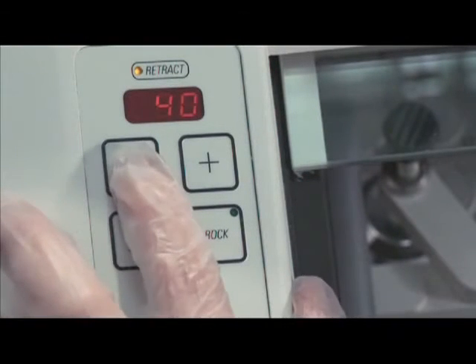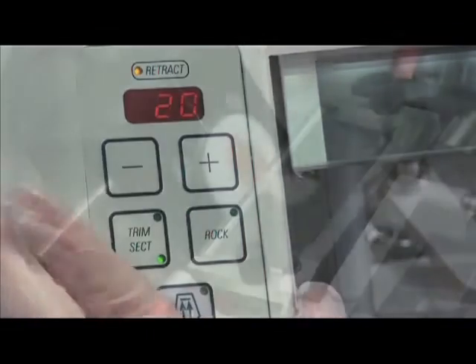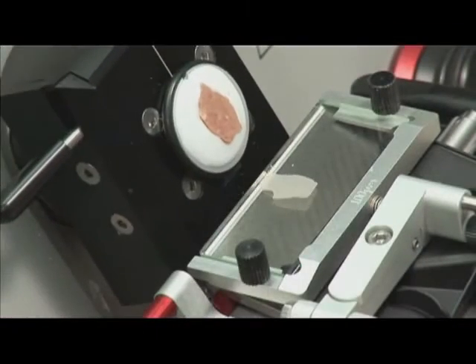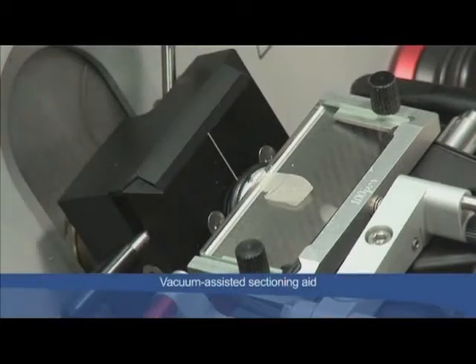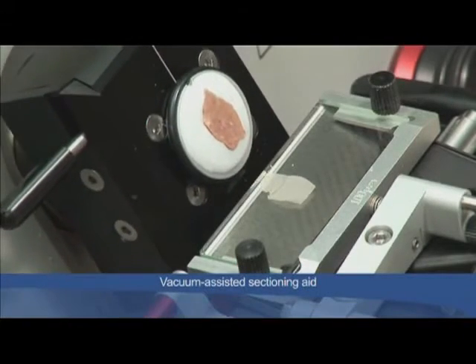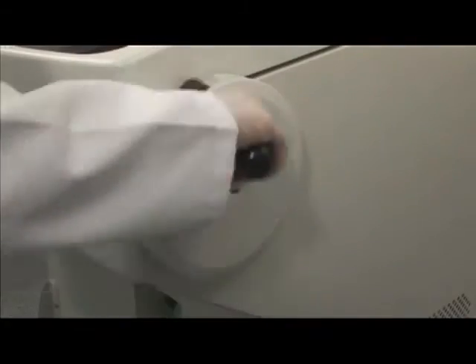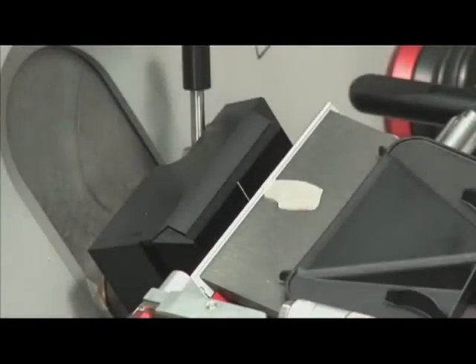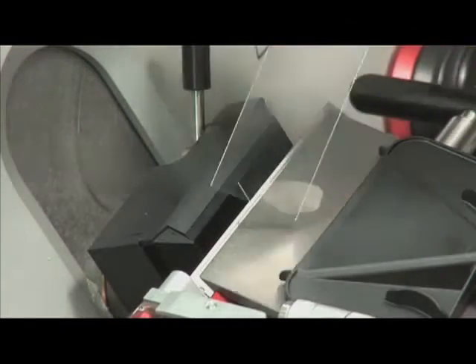Self-explanatory buttons and easy-readable LED displays simplify the cryo-sectioning process. In sectioning mode, the vacuum sectioning aid ensures optimum section stretching. The result is a perfectly prepared thin section.